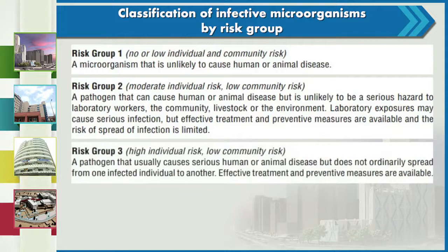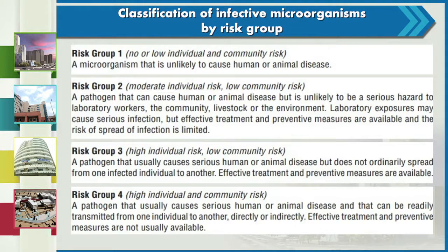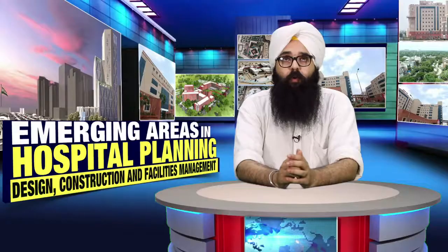In risk group 3 there is high individual risk but low community risk. The pathogen usually causes serious human or animal disease but does not ordinarily spread from one infected individual to another, and effective treatment and preventive measures are available. Risk group 4 carries high individual and high community risk — the pathogen causes serious disease and can be readily transmitted directly or indirectly, and effective treatment and preventive measures are usually not available.